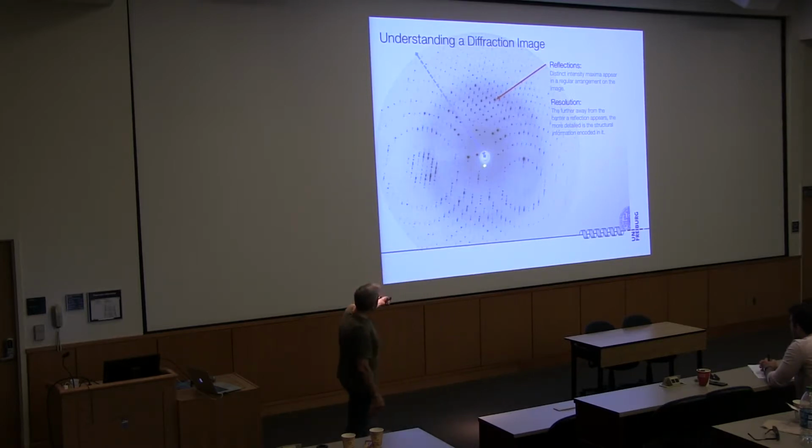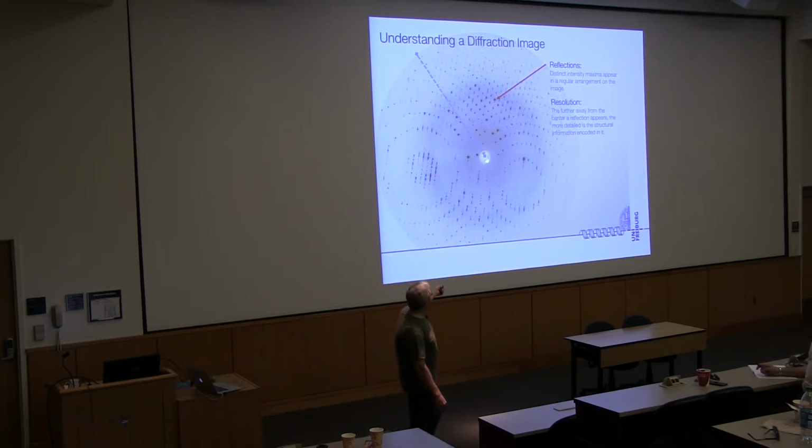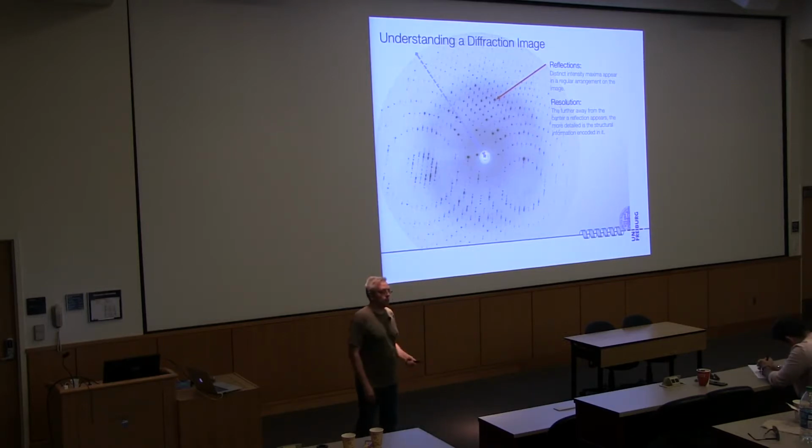Then in the middle, you saw Max von Laue had a black spot. That was where the X-ray hit that thing. Our X-rays are a bit stronger nowadays, so we need to put a little piece of lead, a beam stop, that keeps the primary beam from actually hitting the detector, because otherwise everything would be black. That's why they all have a little white spot in the middle, which is a bit of a pity, because that is also, of course, where one reflection would go, forward scattering. That is the strongest reflection that we have in there and that we cannot collect for that reason.